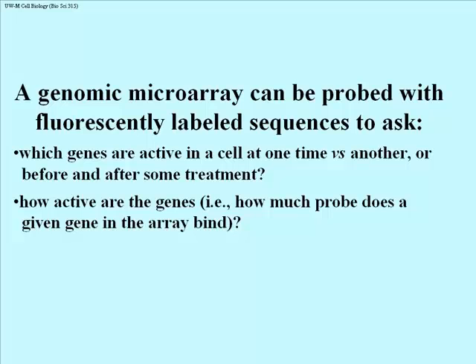We could ask questions that are quantitative in nature. It turns out the microarrays are excellent for measuring things. So, for example, we can say how active are genes at one time versus, say, another time, or in one tissue versus another tissue, because we can quantify how much of the probe that we're using is actually binding to one spot in an array versus another.